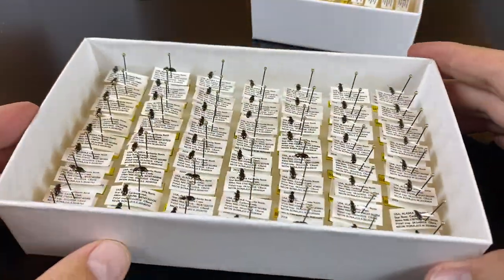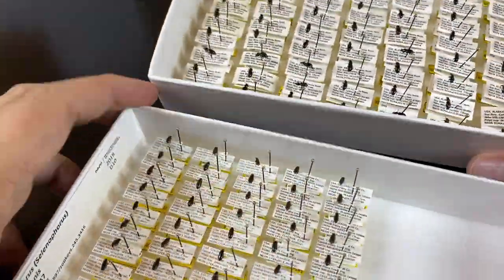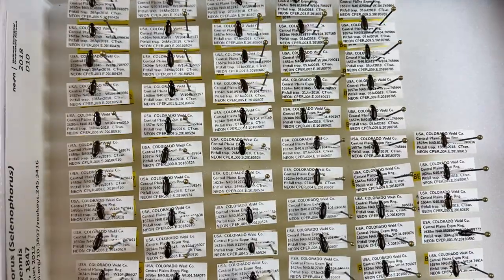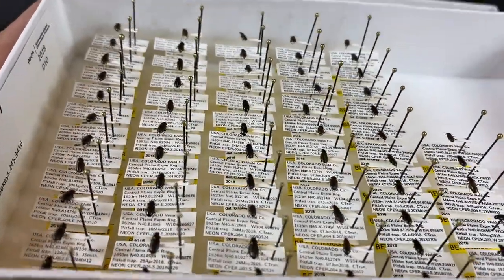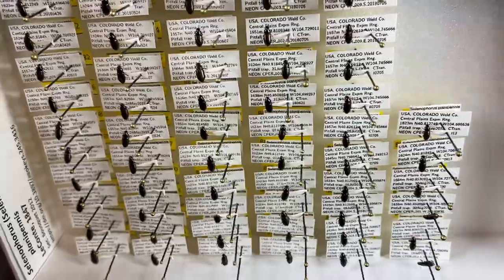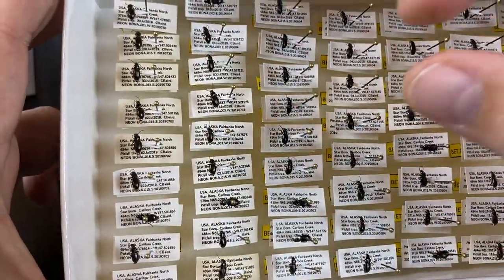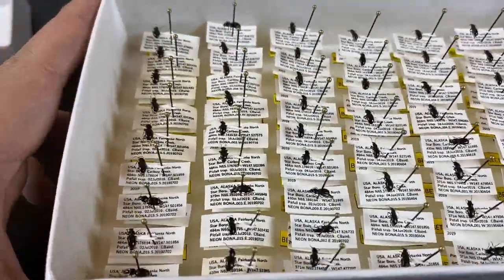We also want to think about the practical use of these specimens for future researchers. Coming back to this example, if I'm a researcher who comes here in 10 years, I can pick these up and it's easy to see and read — I can look underneath and find the sample ID number and the catalog number on those yellow labels. Here, with this other tray, I'm probably going to have to start pulling specimens out one by one and looking at the labels underneath because I'm not really able to see them.